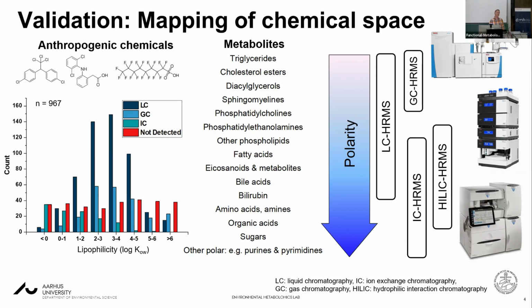So, which ones do you not capture? I think there are some very low molecular weight substances that are problematic in drinking water supplies, and there are also some other problems with Orbitrap systems in that connection. We cannot go that low in scan range.